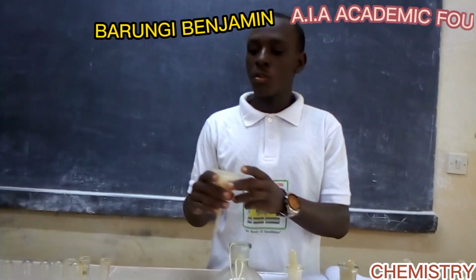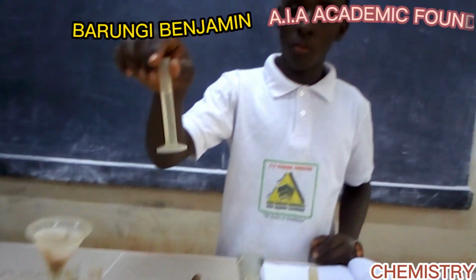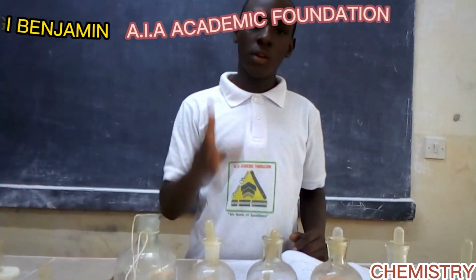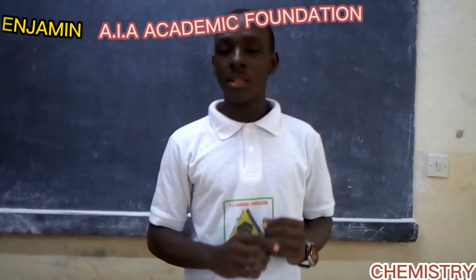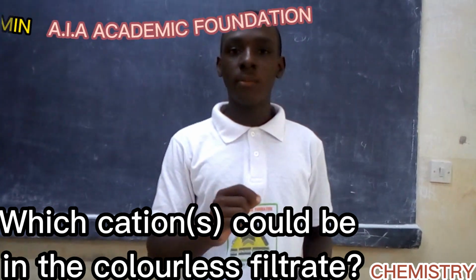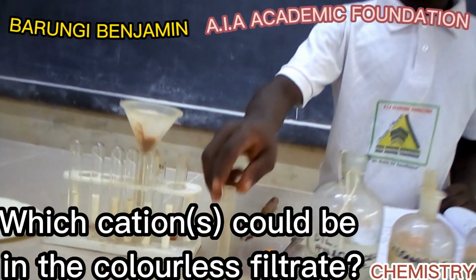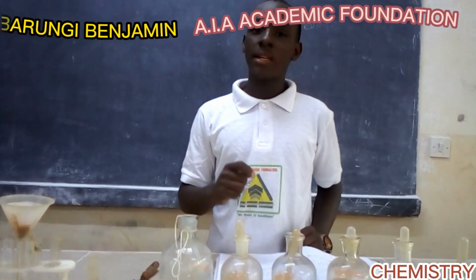This proves to us that there could be some cations that dissolved to form a colorless solution. The cations that usually dissolve in sodium hydroxide are three. The first cation is zinc, 2 ions. The second is aluminium, 3 ions, and lead 2 ions. So when we are recording in our deductions, we shall say zinc 2 ions, aluminium 3 ions, and lead 2 ions are suspected present.